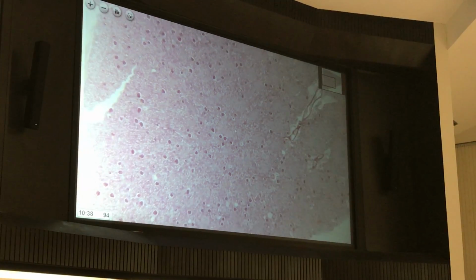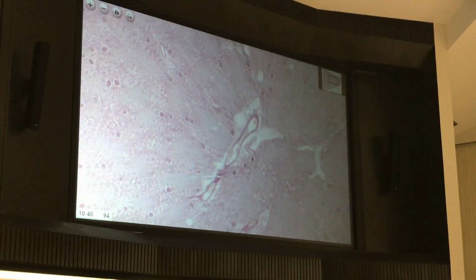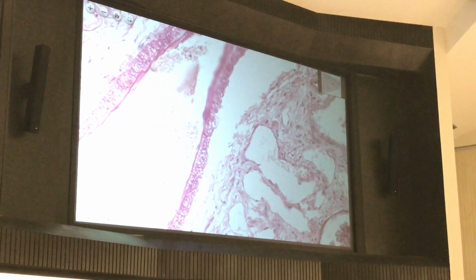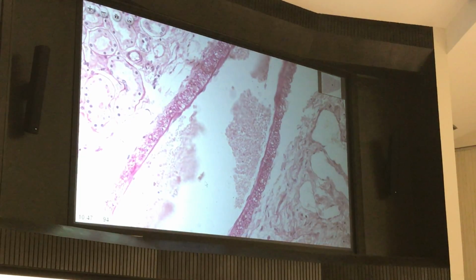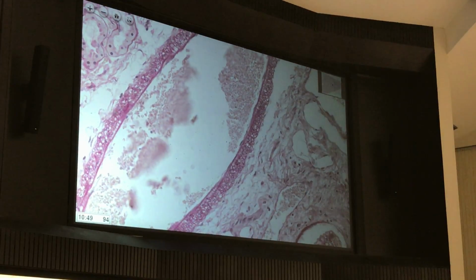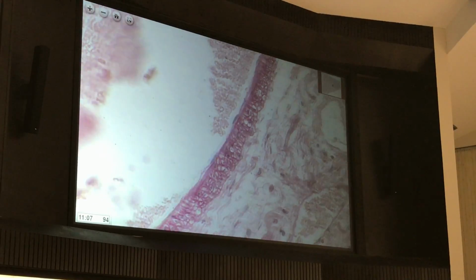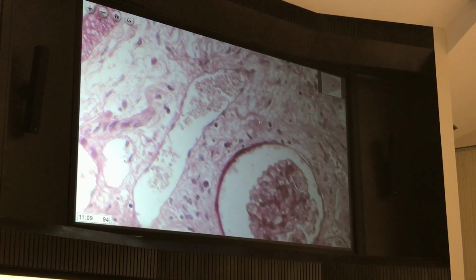Let's see what else we can see. I think now let's go over here. So it's really handy when I show you something with blood in it, but this is a blood vessel. And again, what is this? What type of tissue is this? Endothelium, yes. And we can see, in this case, it's stained also with PAS, and we can see, I didn't point it out before, that nice basement membrane that it's sitting on. And the same thing is true for here.